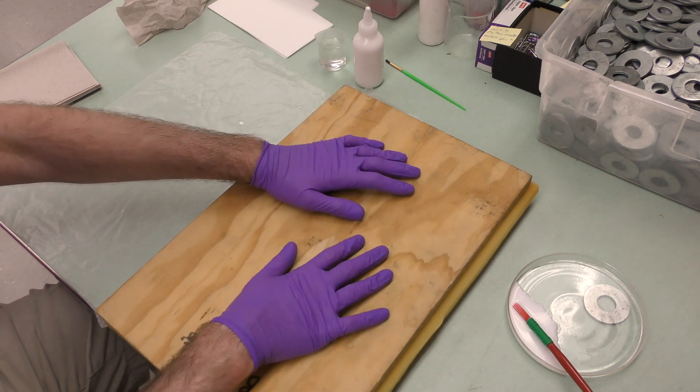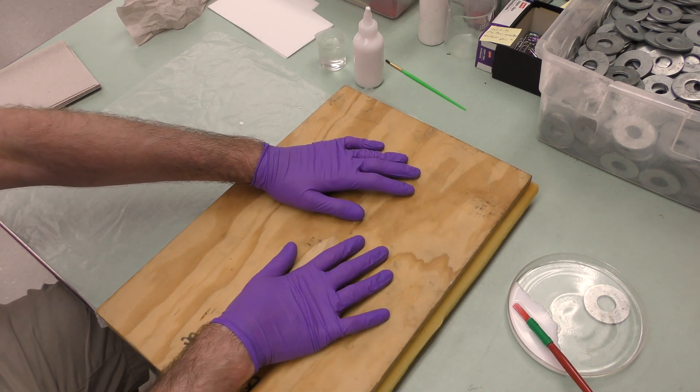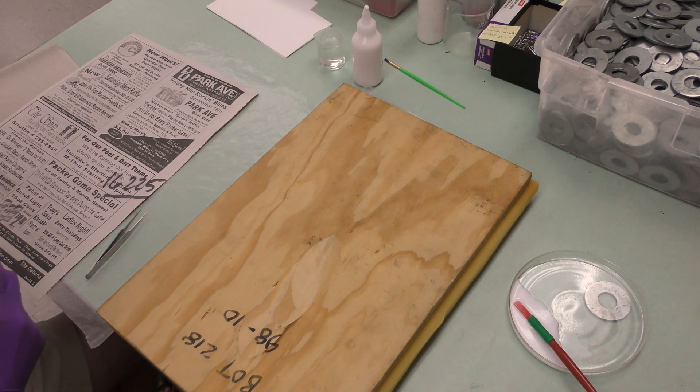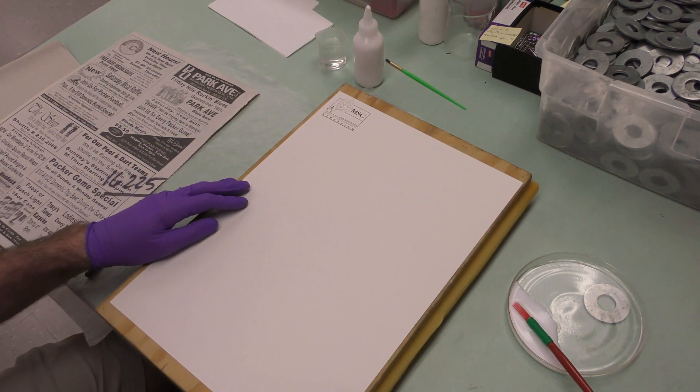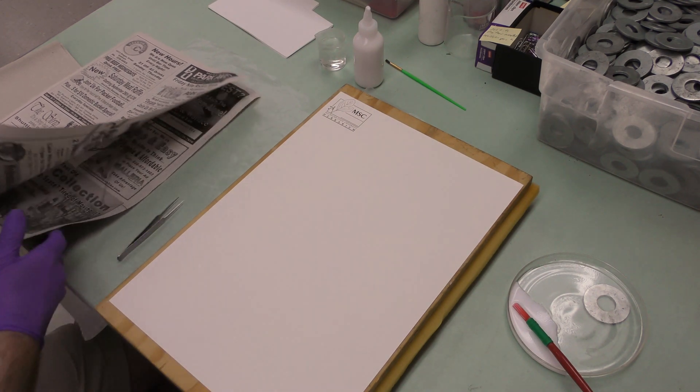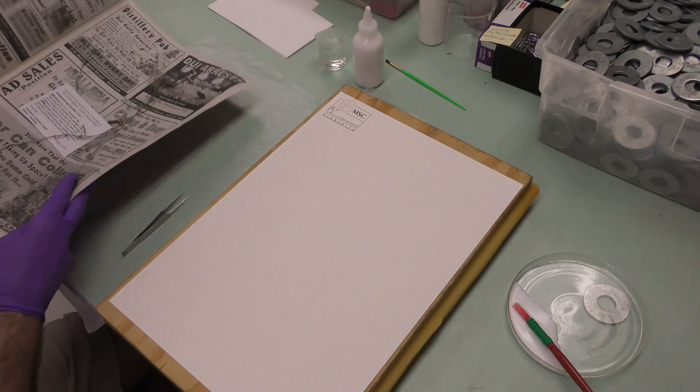That's really all there is to easy specimens. Now I'll show you a more challenging specimen. The next one is much wispier and more fragile, so I'm going to have to mount it slightly differently. These of course take longer.